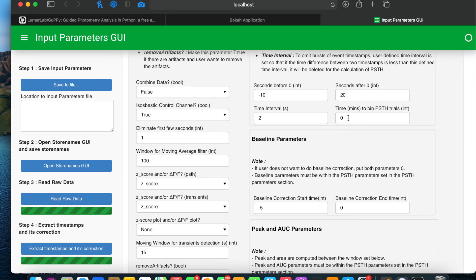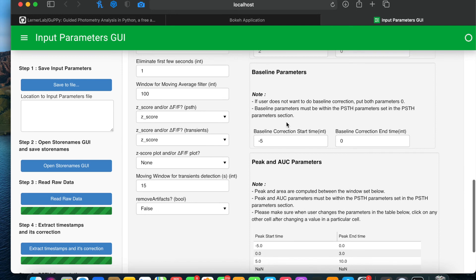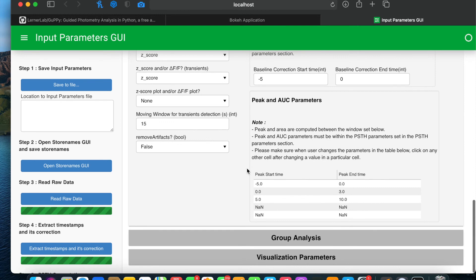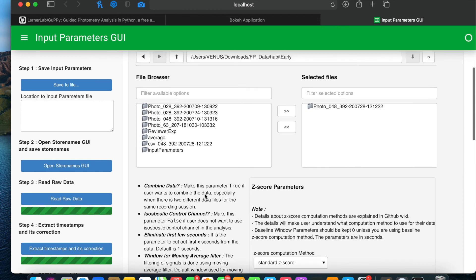Guppy also provides a binning of the PSTH trials. For example, if you set the value to 10 minutes, it will bin those PSTH trials in 10-minute windows. Baseline parameters allow you to calculate baseline and perform baseline correction in the PSTH trials. If you don't want baseline correction, you can set both these parameters to 0. You can also provide up to five different windows to calculate the peak and area under the curve for the mean PSTH trial, and Guppy will compute those values for each window. These are all the parameters in the individual analysis section.